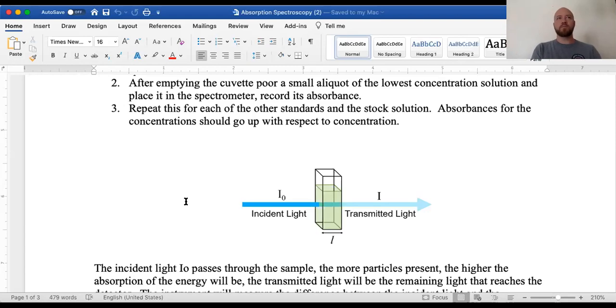In this one, that same glass of Kool-Aid may be very light to begin with, but as you keep adding Kool-Aid to it, it gets darker and darker. So what we use in this lab is called absorption spectroscopy. We pass a light through the sample. As the sample absorbs light, the instrument measures how much light comes out the other side. And so we can correlate the amount of light absorbed by the sample to its concentration. What we are reading is, I'm going to put a concentration I know into the instrument.